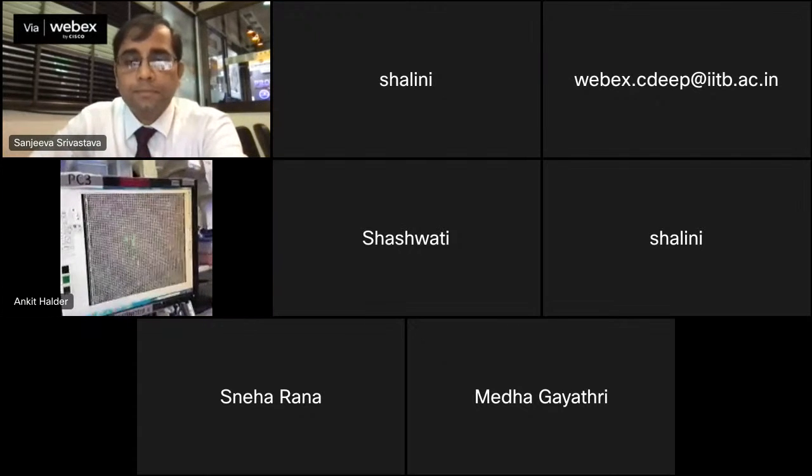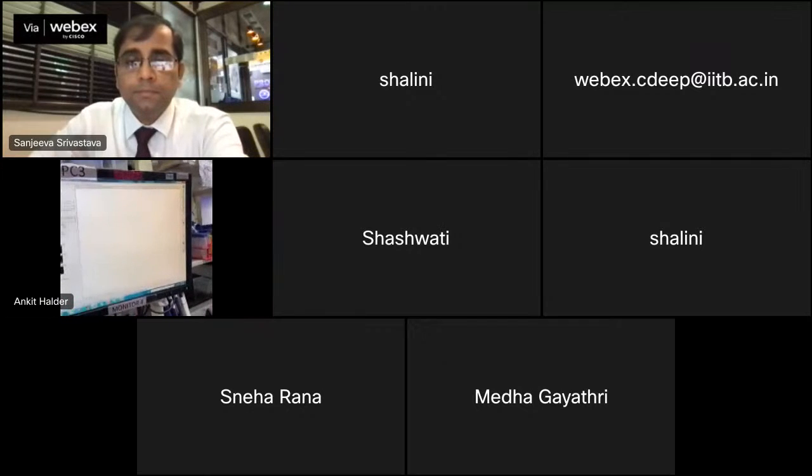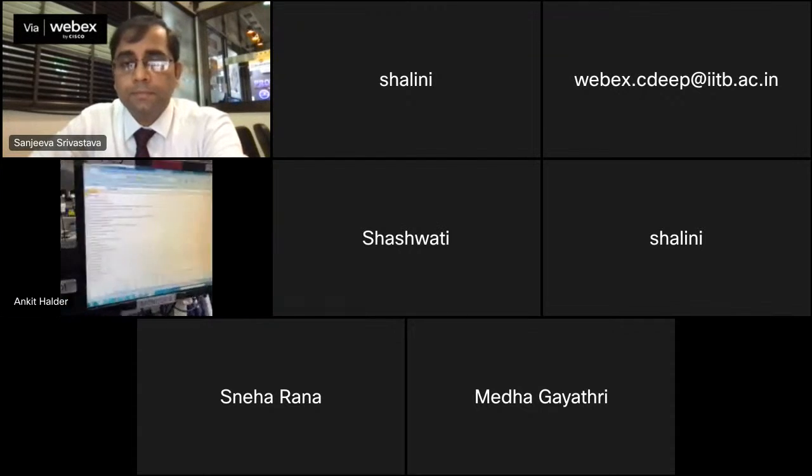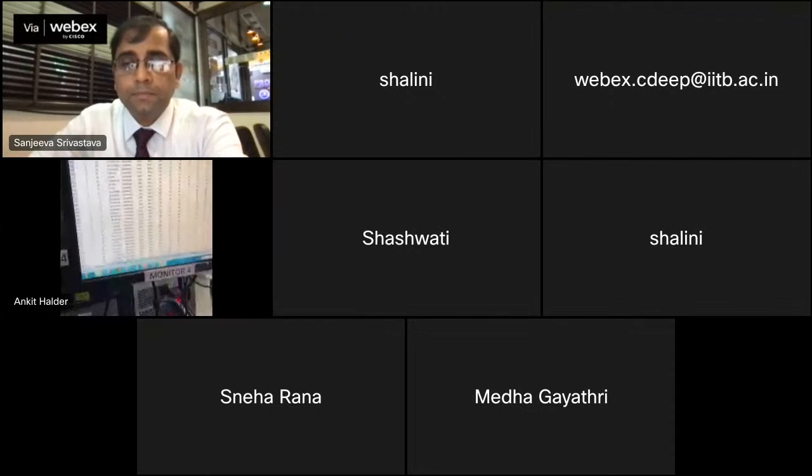Now in the same way, if we go to the result section and finally click on the data, the data is generated accordingly. This data is actually important, and it is called the GenePix result file. And what is the GPR file? It's an Excel sheet. Now you can see this is the GPR file.